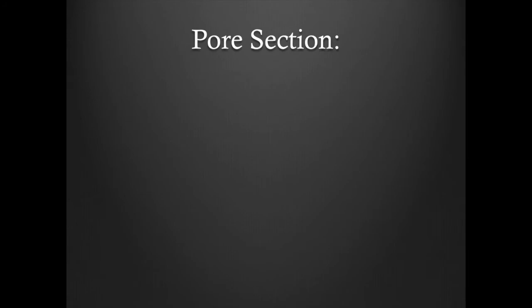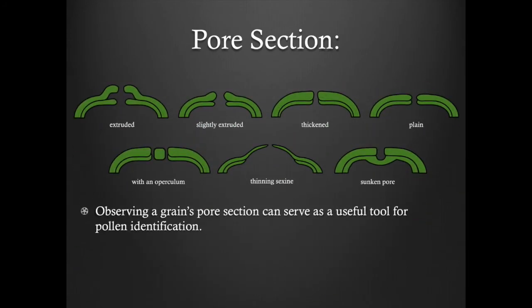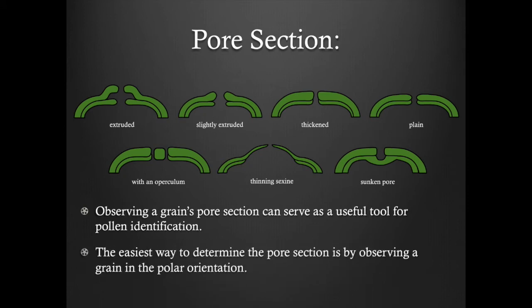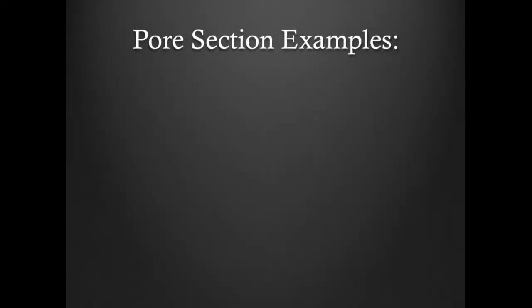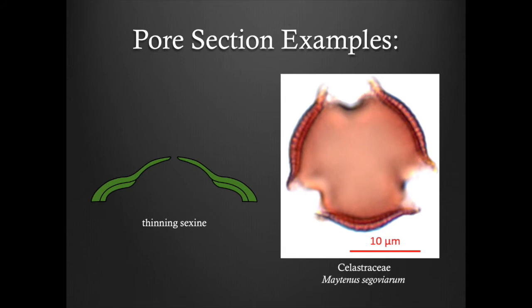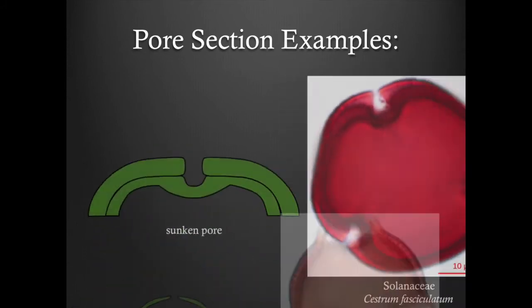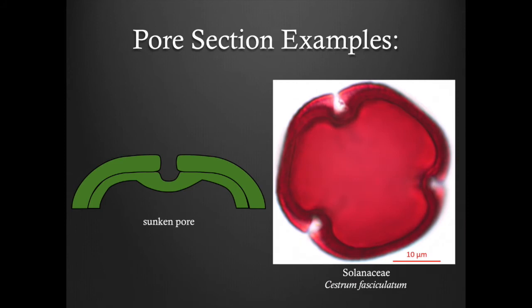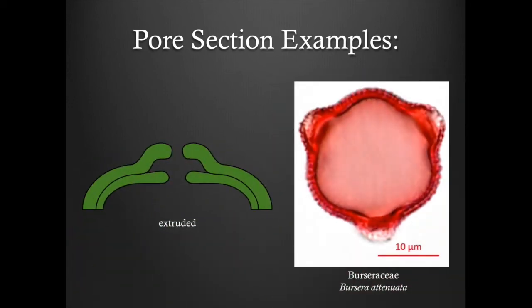Pore section. Observing a grain's pore section can serve as a useful tool for pollen identification. The easiest way to determine the pore section is by observing a grain in the polar orientation. Here are some examples of pore section: a pore section with an operculum, a pore section with a thinning sexine, a pore section with a sunken pore, and a pore section with an extruded pore.